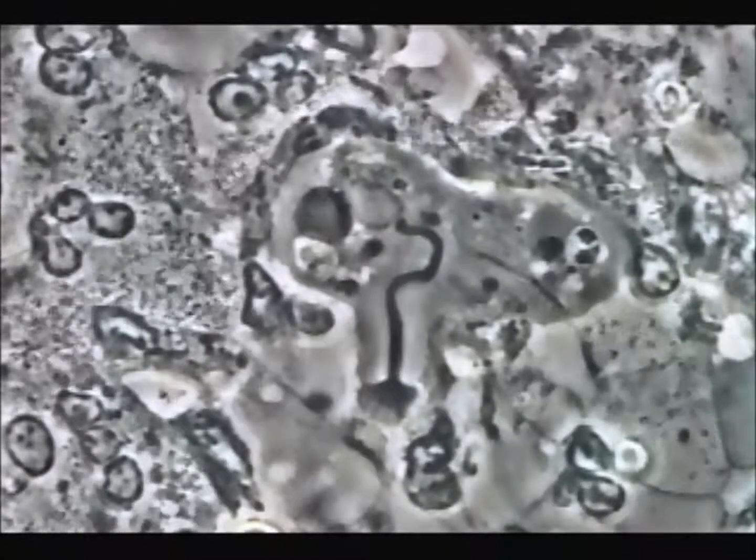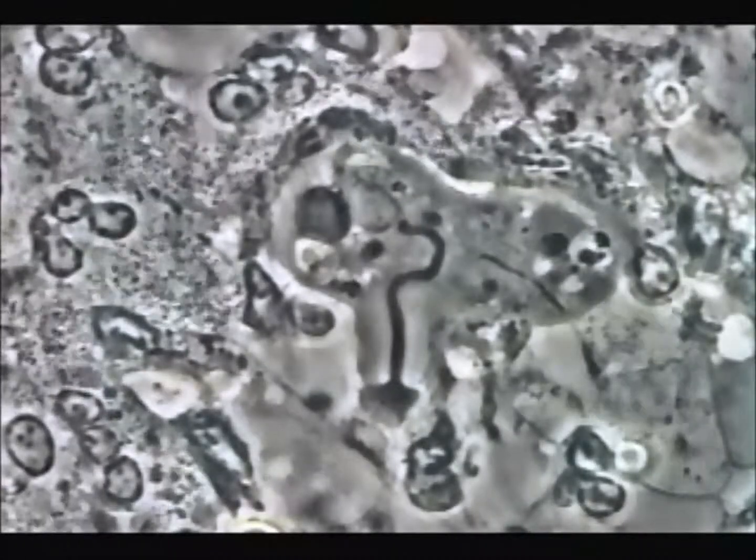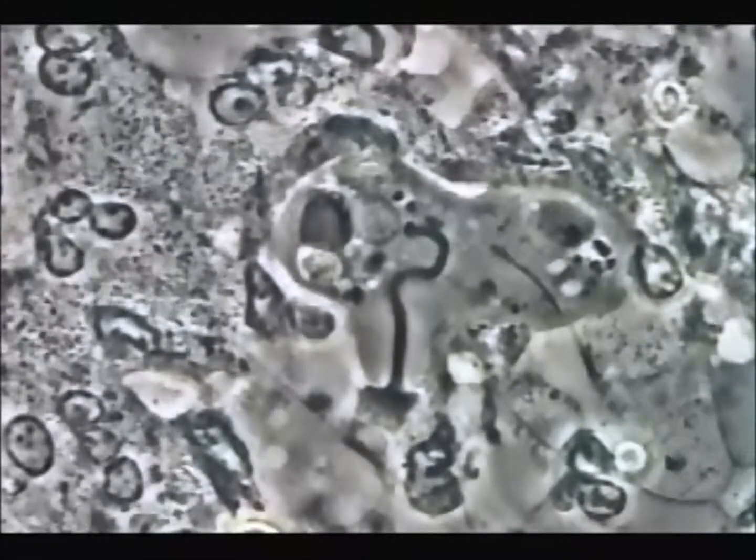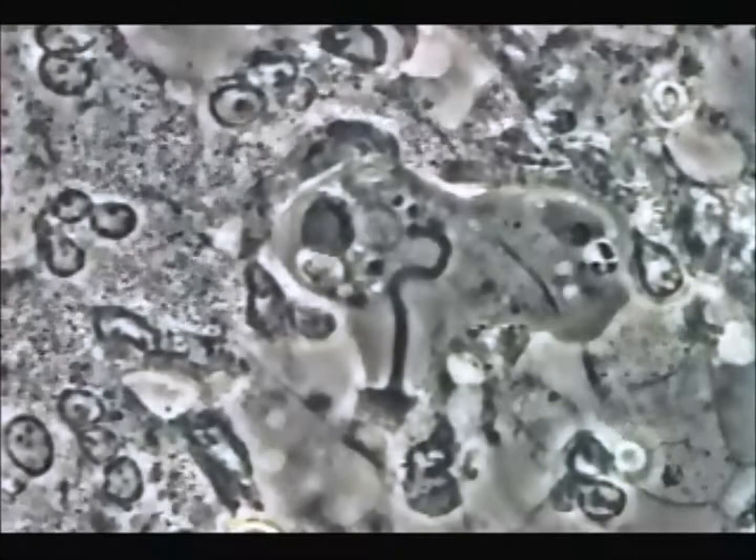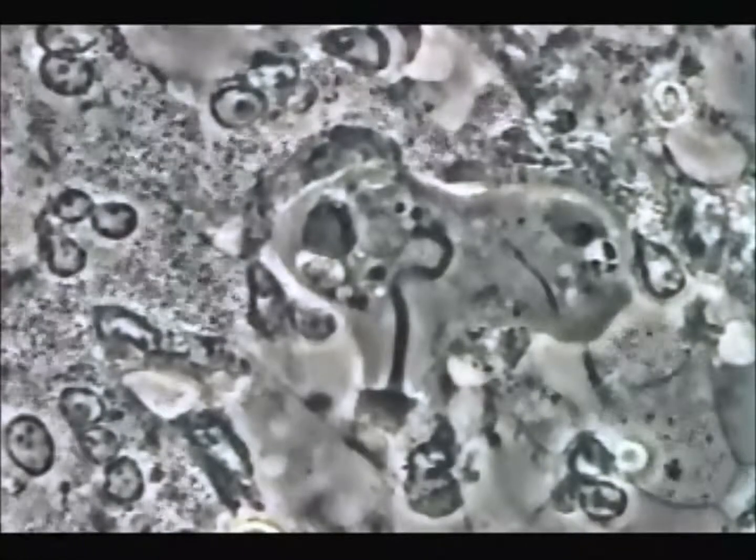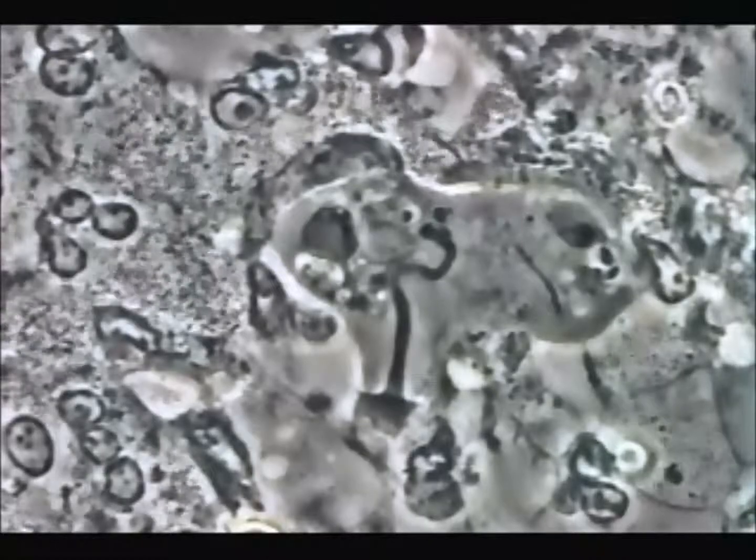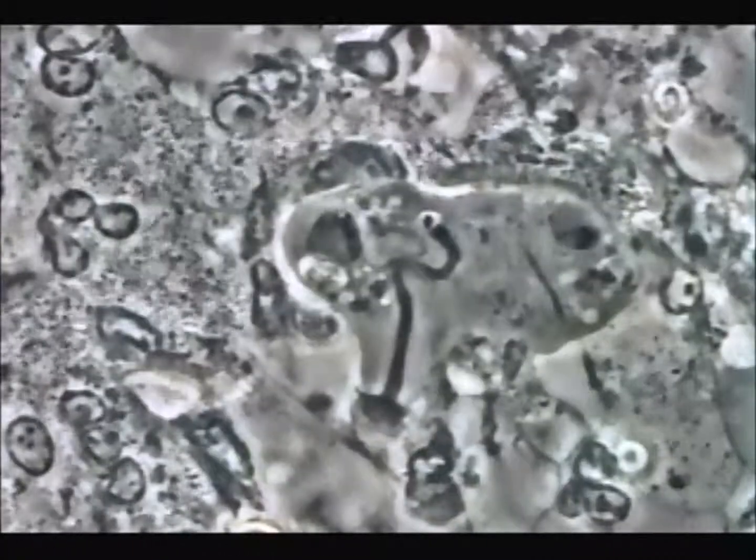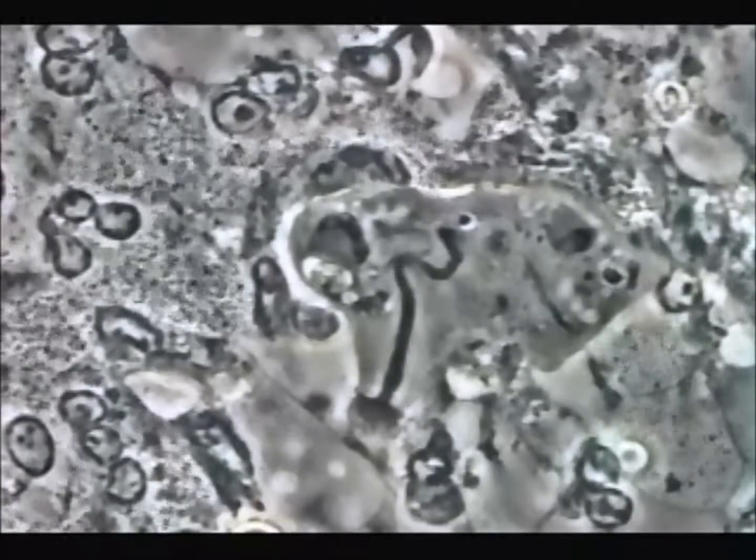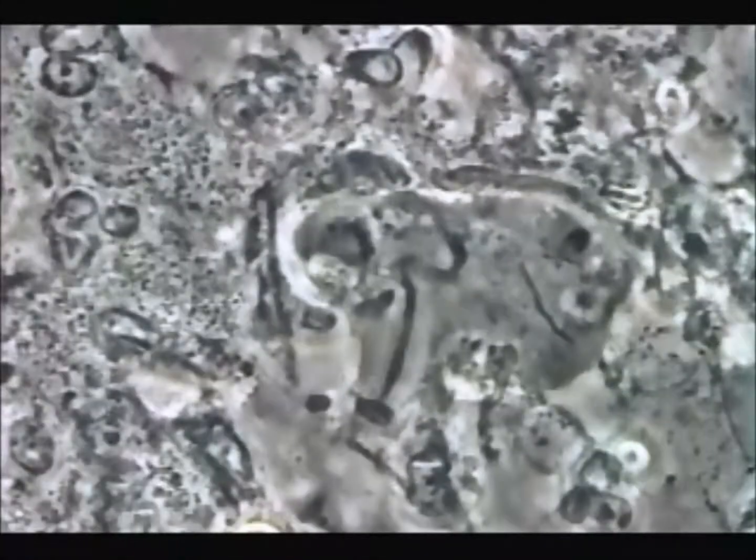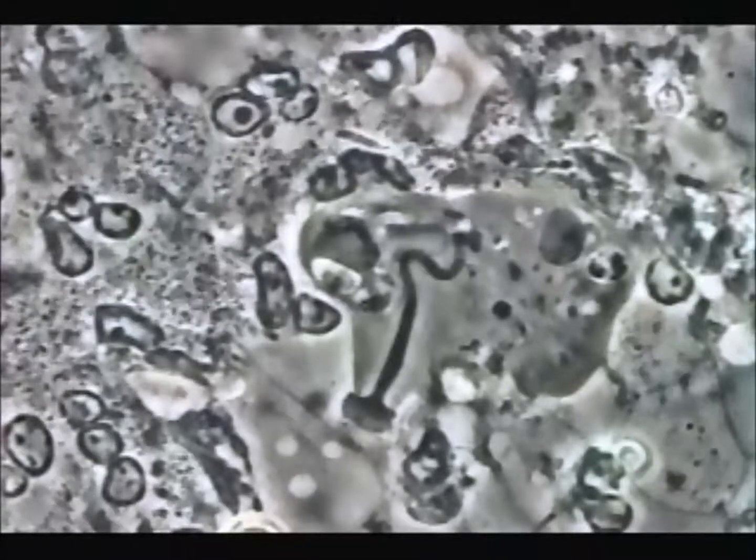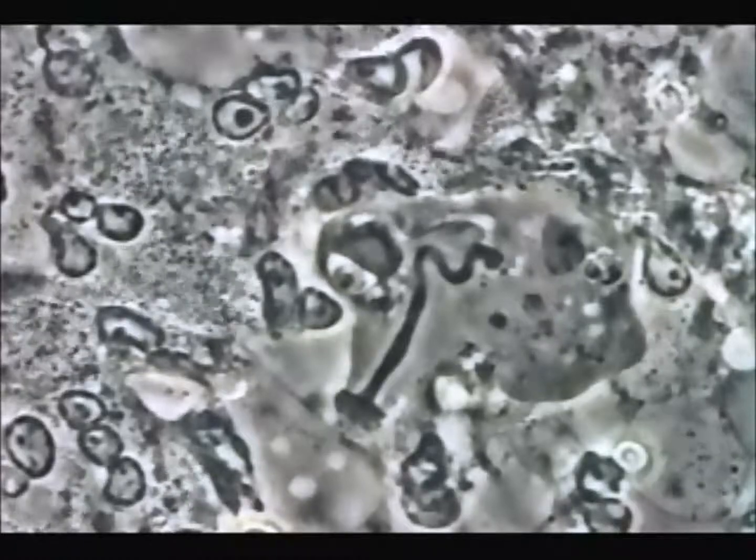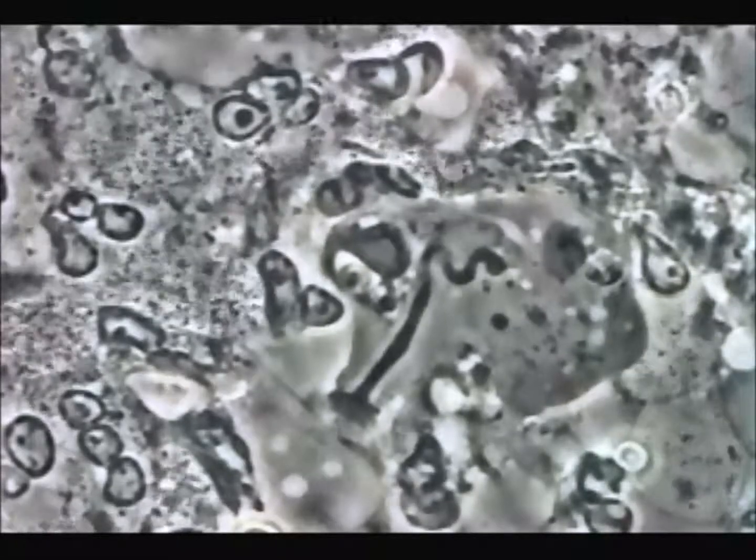You see those little nucleus three-lobe nucleus, and within the cells you see the granules that are very active from the immune system. This is typical to the biofilm of periodontal disease: you see the infection and you see the inflammation from the immune system and the white cells.